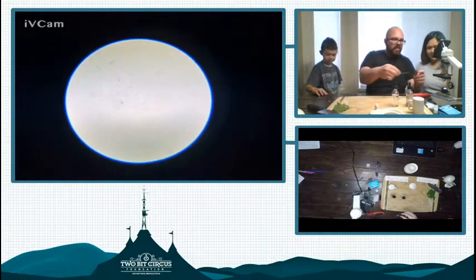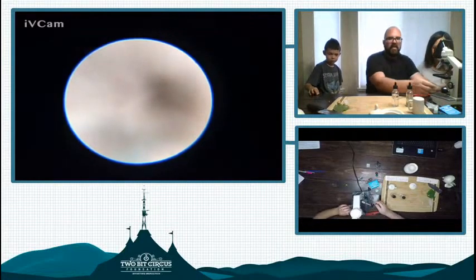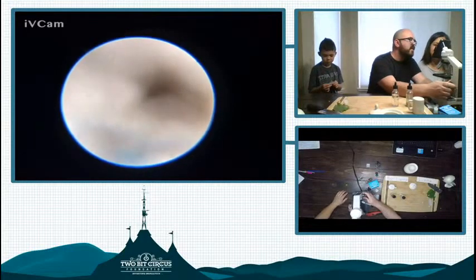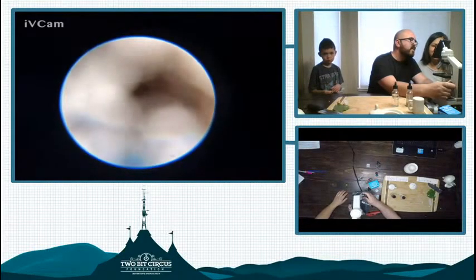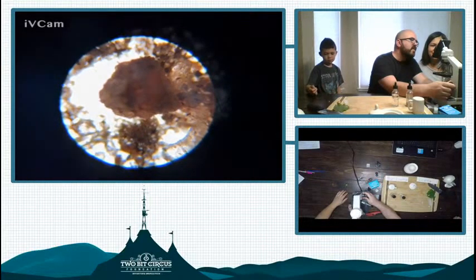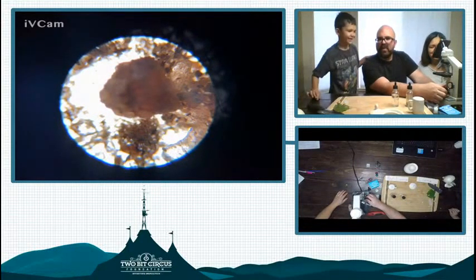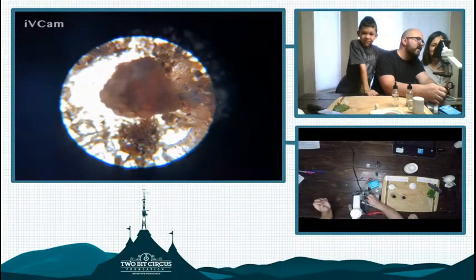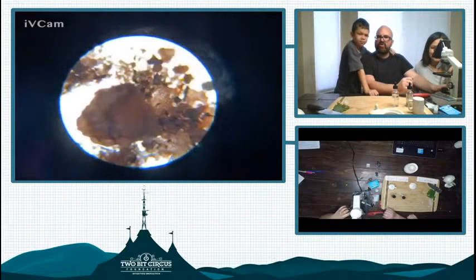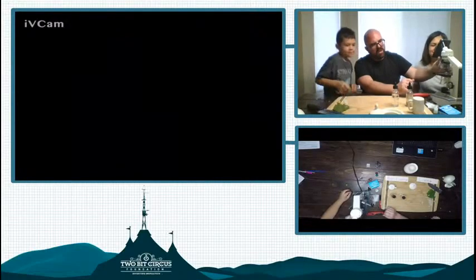Awesome. So we have our dirt from our backyard that we are going to look at now. Focus in here, see if we see anything. Yeah, bring it up. Ooh, Robert, look at that. So that's what our dirt in our backyard looks like. And I don't see anything like cell pattern structures in there, do you? So it's not alive. Let's try to zoom in closer just to double check.